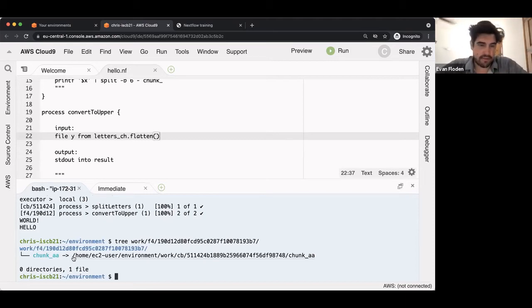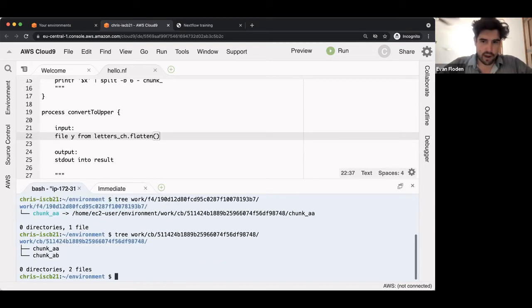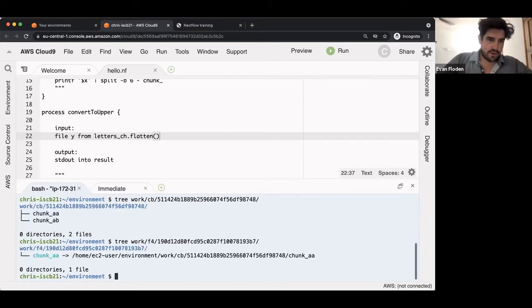The final thing that I want to show you is that inside this working directory, we've seen that we've got the output files, like the one I showed you before. We also have the input files, like this one here. It's got it as an input file. What about if we think about what else is in there and how it's able to keep that state? Well, we have inside that same location.